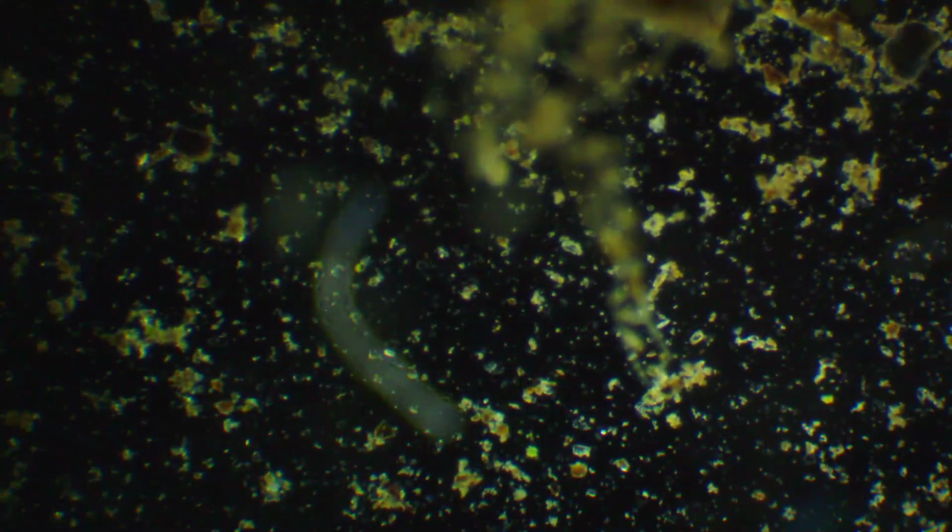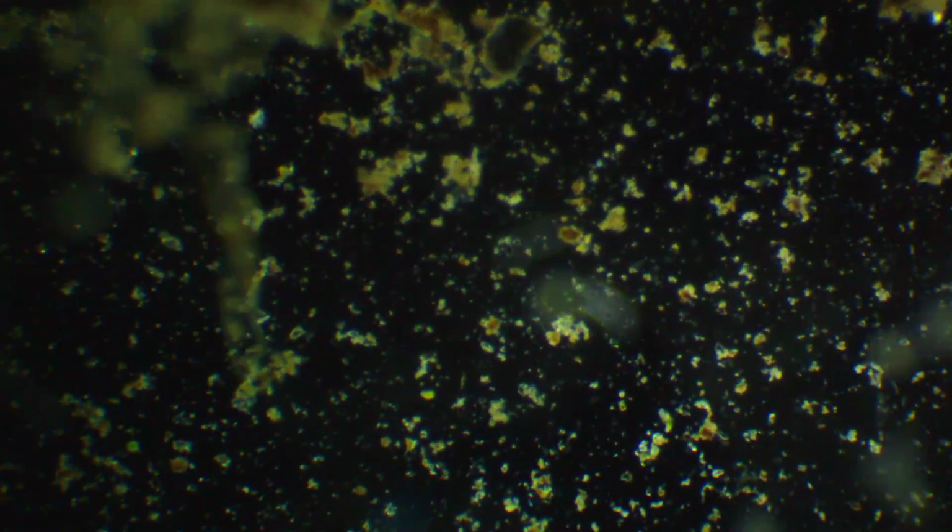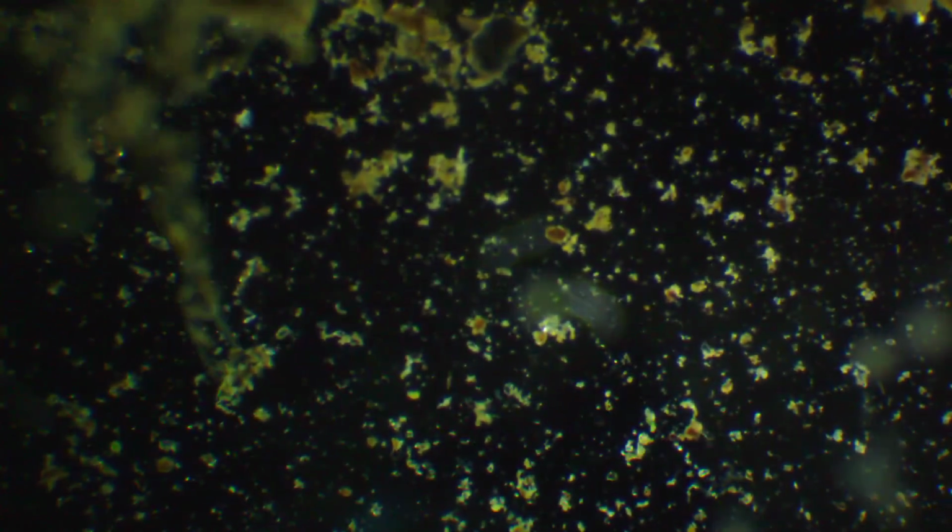Got some little paramecium looking things. Yeah. That looks like some sort of foreign object that I do not know how to identify. What else we got here? Things floating on the surface. No, those are scratches on the bottom of the slide. That's what that is.